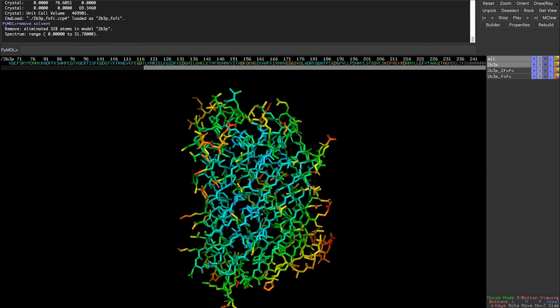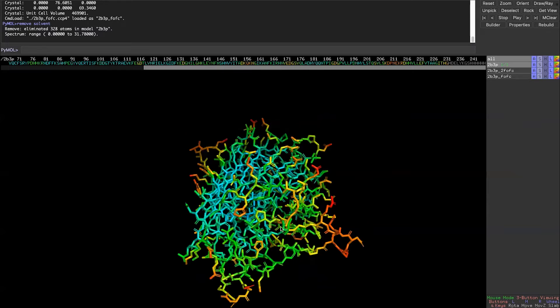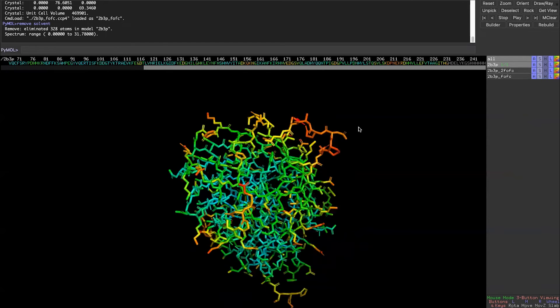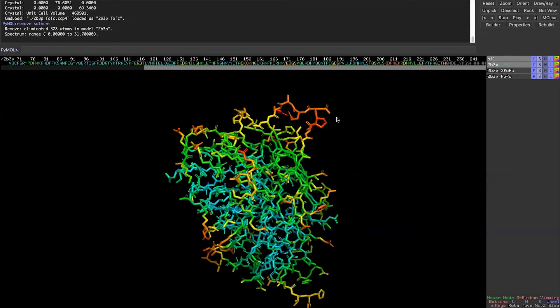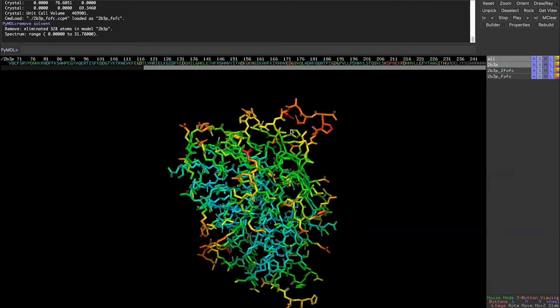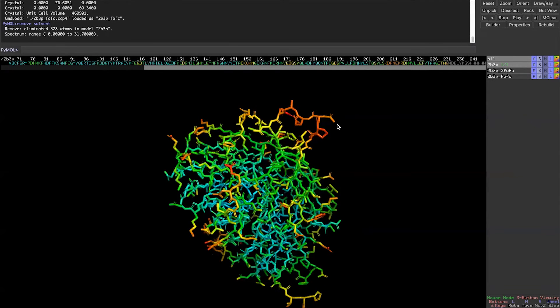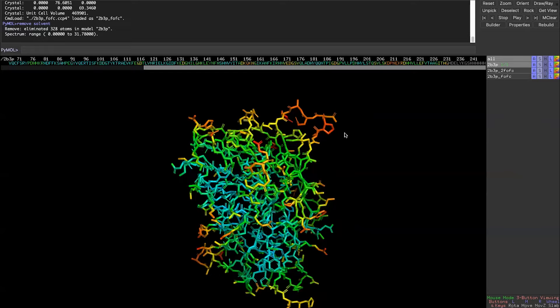B-factor is a measure of flexibility — basically how confident we are about the model in that region. Regions that are really flexible and dynamic will have a high B-factor and be colored red, and the map in those areas will be really fuzzy or might not be visible at all. You'll also notice those high B-factor areas tend to be on the outside of the protein and in loops.